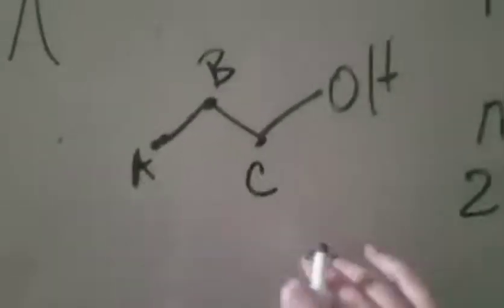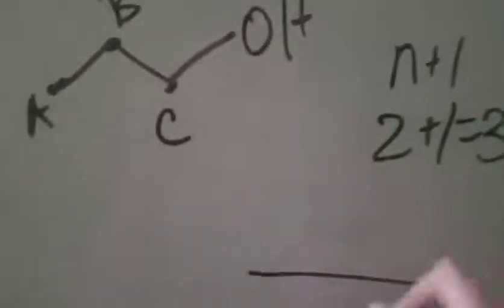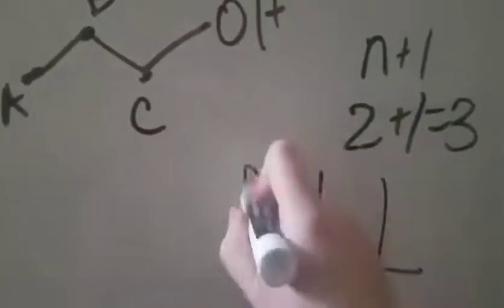And so that's how I'd go about it, and I expect to see about 3 peaks, and I would use my chemical shift on the carbon table to figure that out. Or this one. It depends on which one you have. They're all basically the same. And you're going to use electronegativity more for the carbons than you will for the protons. Just think about what's getting pulled, what's getting shielded, things like that. So that is what I expect for your annotated NMRs and IRs.